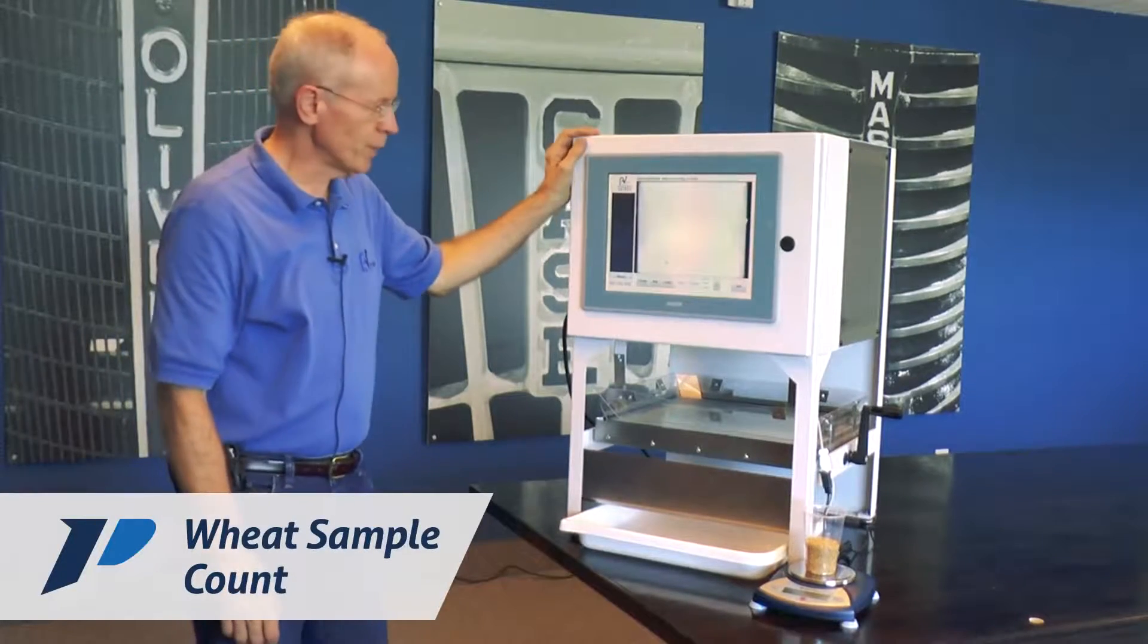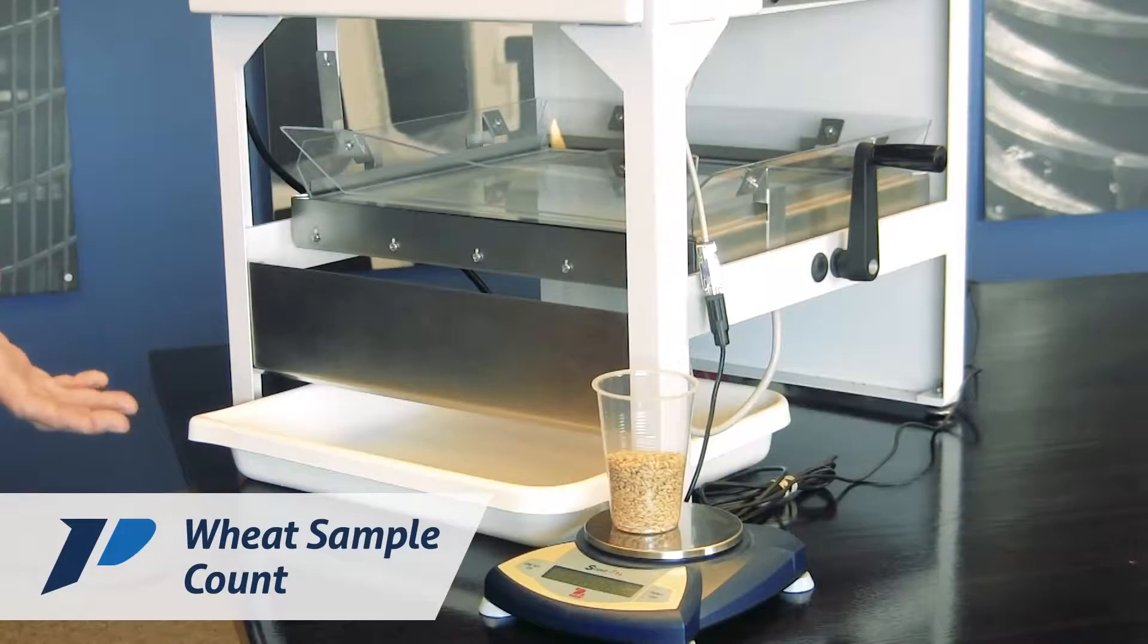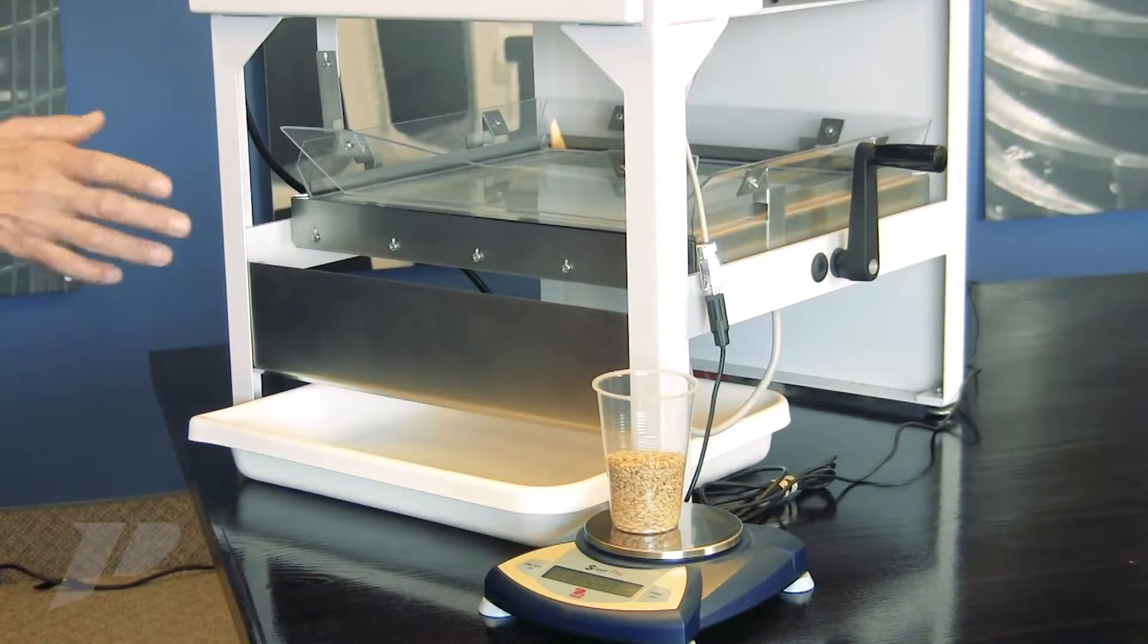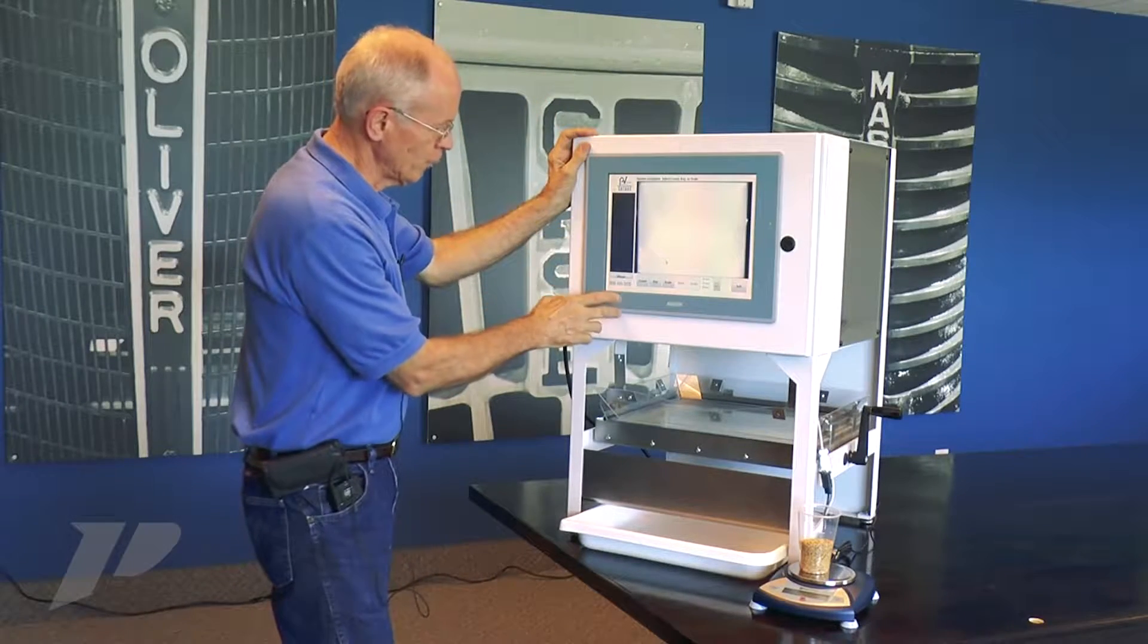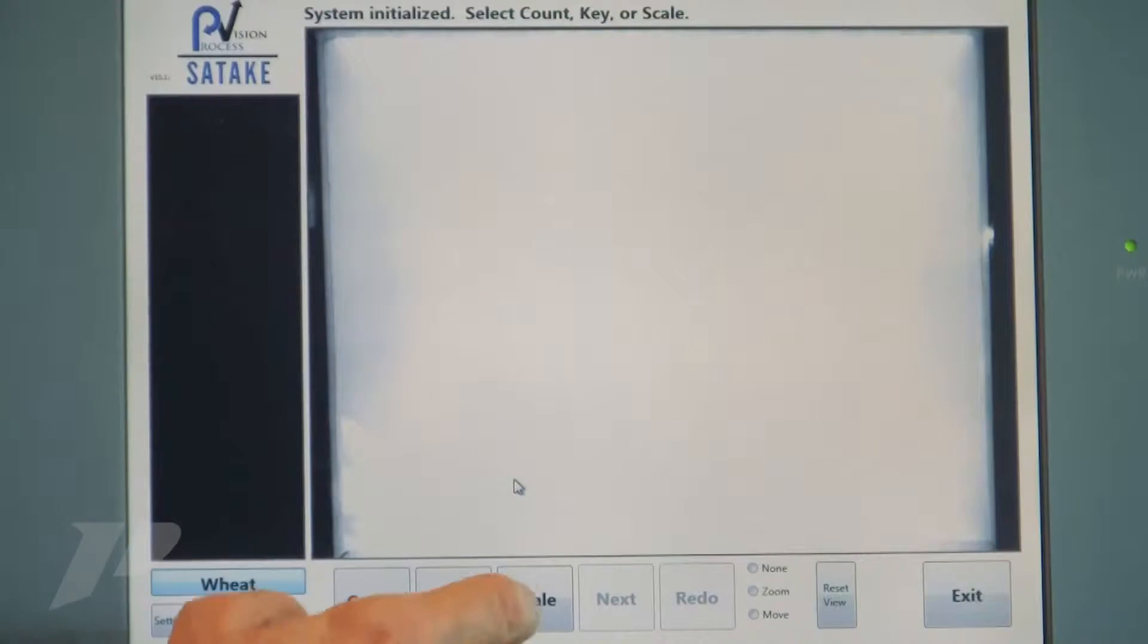I'd like to run a sample for you of wheat on the OptiCount lab. The scale weight will be taken automatically from the scale into the computer. The system's been initialized. We know the recipe that we're on, so I'm going to click scale.